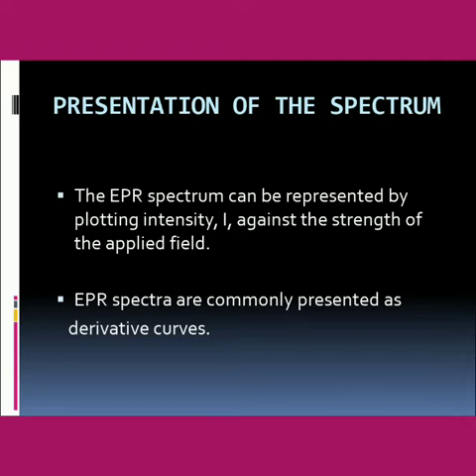The EPR spectrum can be represented by plotting intensity I against the strength of the applied field. EPR spectra are commonly presented as derivative curves.